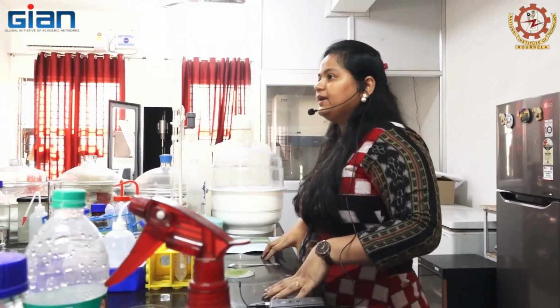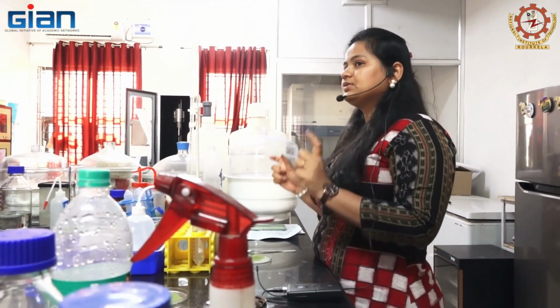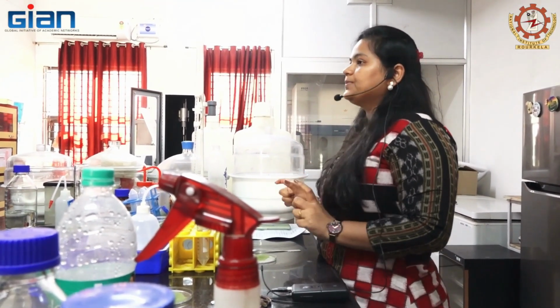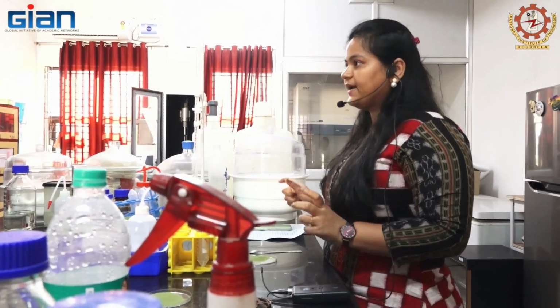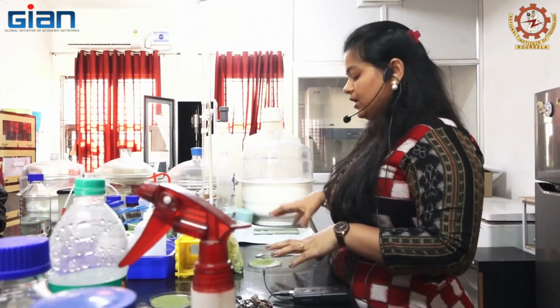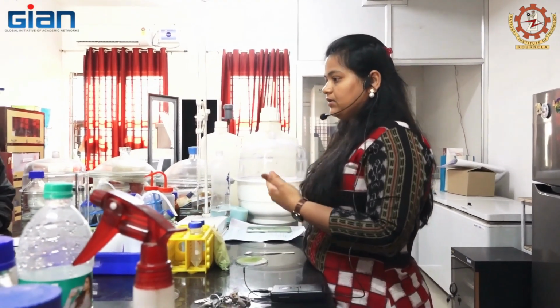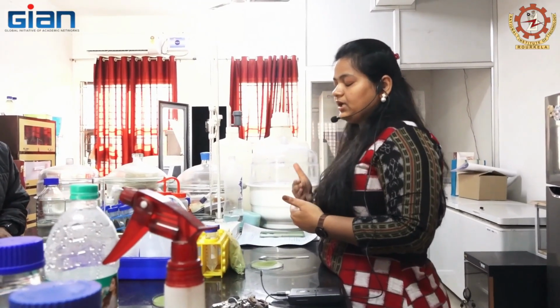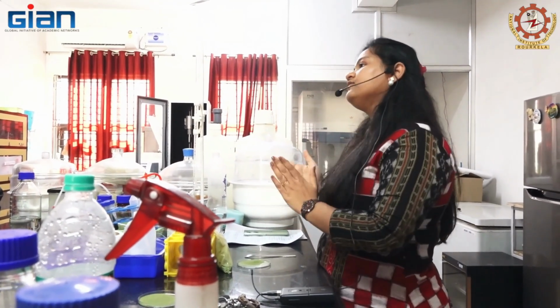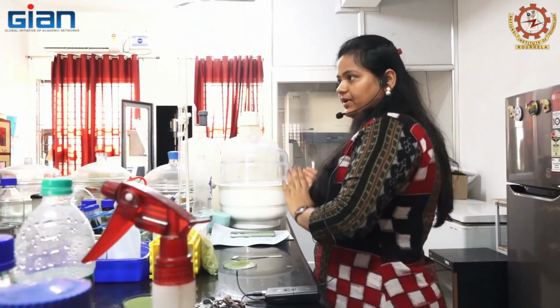What is the meaning of that? Acoustic cavitation is the formation, growth and collapse of microbubbles inside the solvent solution adjacent to the cell walls. What is the concept? Due to the electric fields, there is a conversion of electric fields to mechanical vibration, that is ultrasound waves.